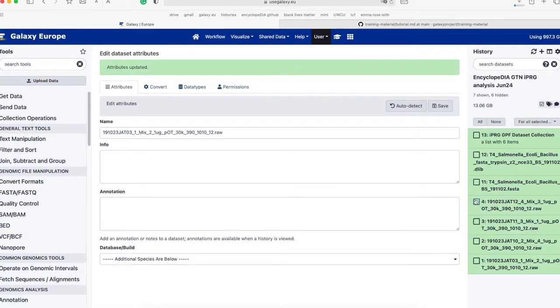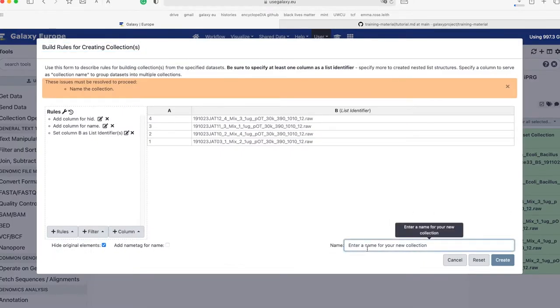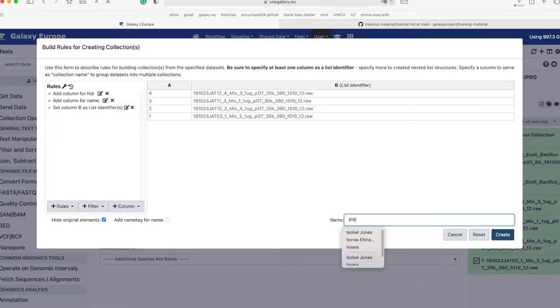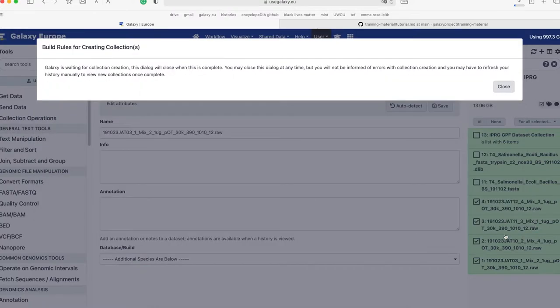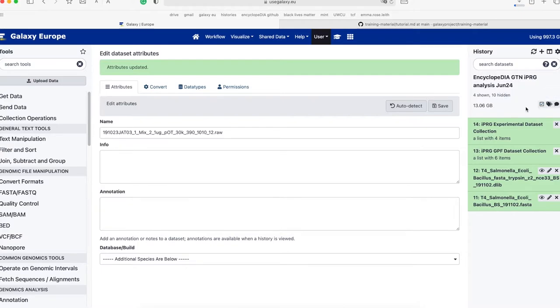We will follow the same steps to generate a dataset collection for the experimental files. Clear your GPF checkmarks by clicking the None tab at the top, and then select the experimental files. Click 'For All Selected' and 'Build Collection from Rules' again. This time I will name the collection 'IPRG Experimental Dataset Collection,' and then click Create. Click the checked box again to remove the selection boxes. At this point you will have two dataset collections: an experimental dataset collection with four items and a GPF dataset collection with six items.